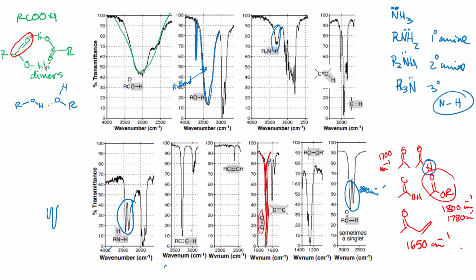If you draw the line here at 3000, this is an alkyne. Notice the alkyne has two important things. The carbon-carbon triple bond at about 2200, and the hydrogen attached to the sp carbon at about 3200 or so, so above the 3000 line.